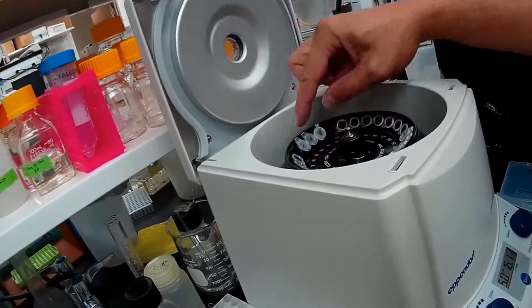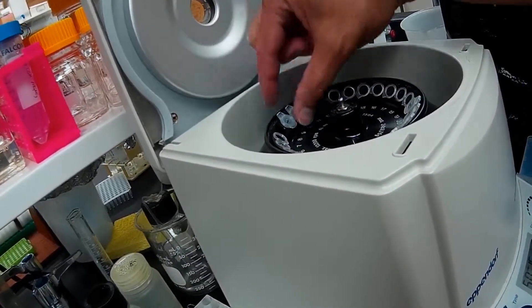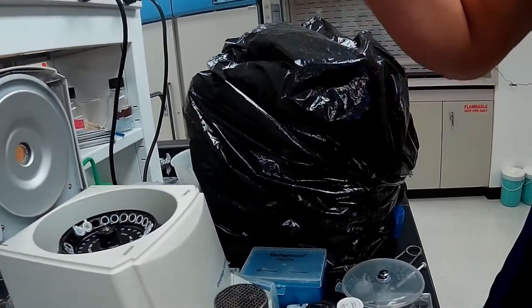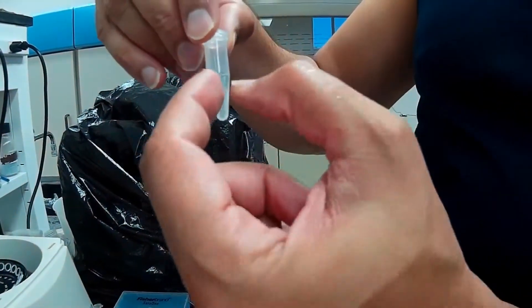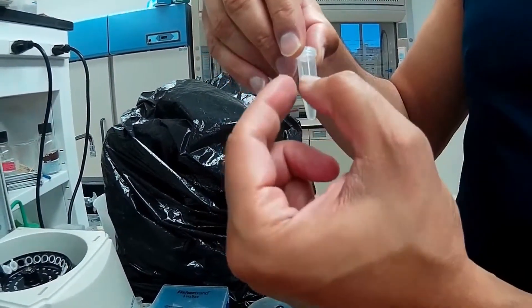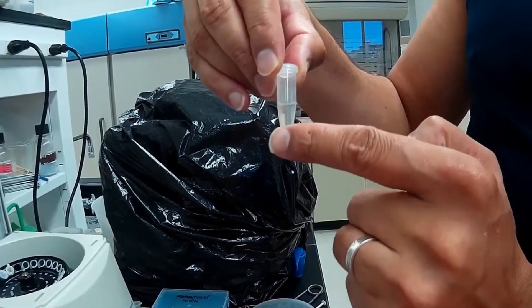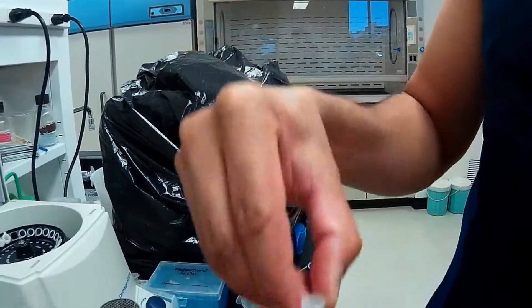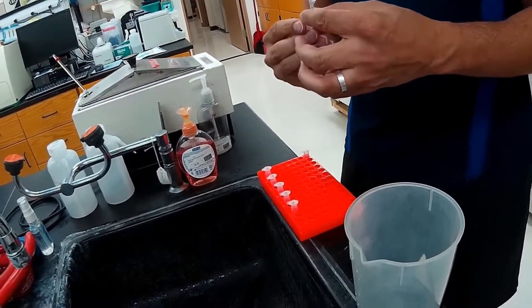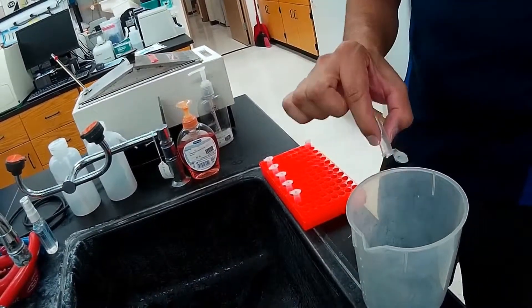The DNA will be pelleted on the outside of the rotor. So if you put the hinge side of the tube on the outside, that's where the pellet will be. It will be spread across that side of the tube and will not be a fine pellet. It will actually be a very dispersed pellet coating that wall of the tube. We discard the supernatant carefully into our bleach container.